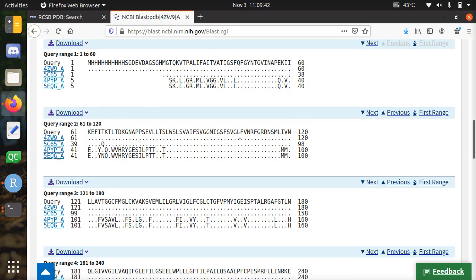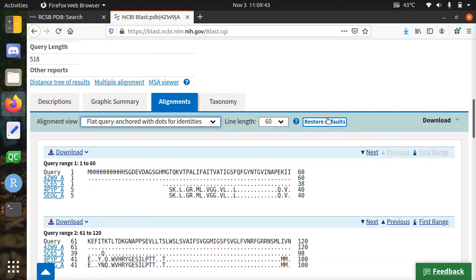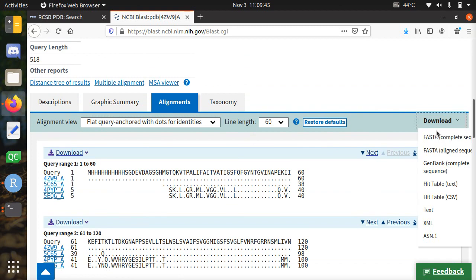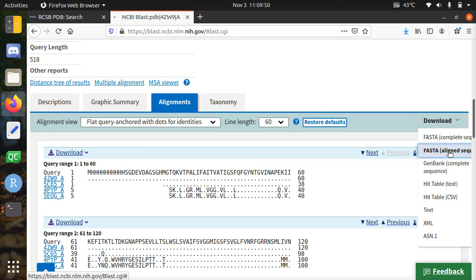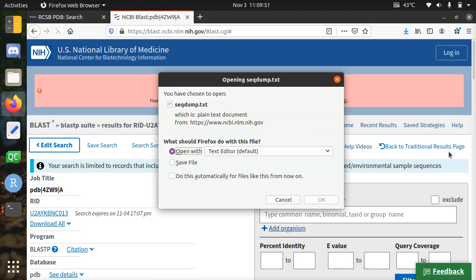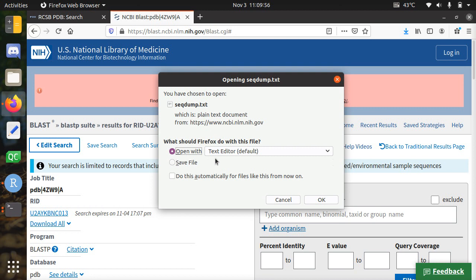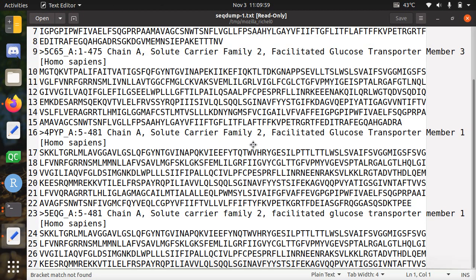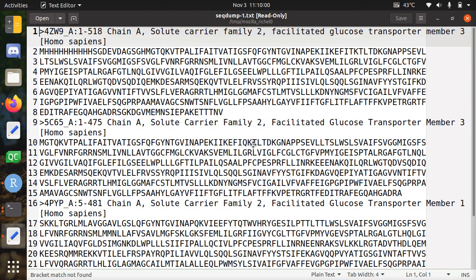I'm going to download the aligned sequence. You see it falls a bit off the screen, which says aligned sequence. I'm going to download it, and it creates a file called seqdump.txt. I'm just going to open it with the text editor so you can see what it looks like.